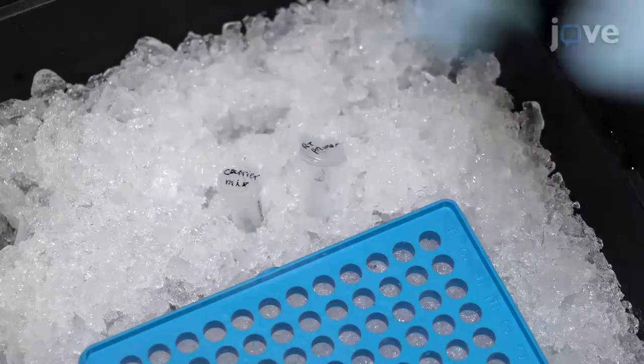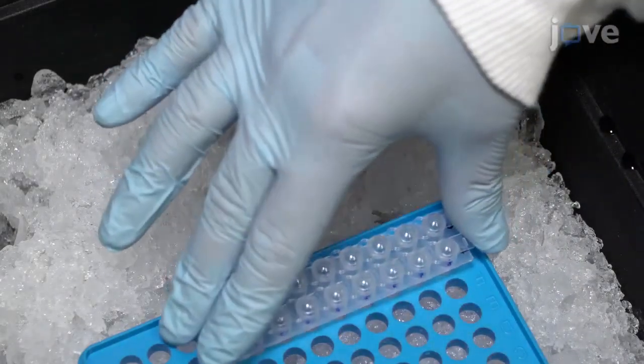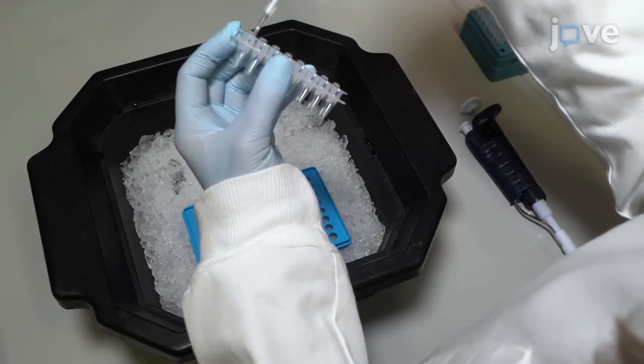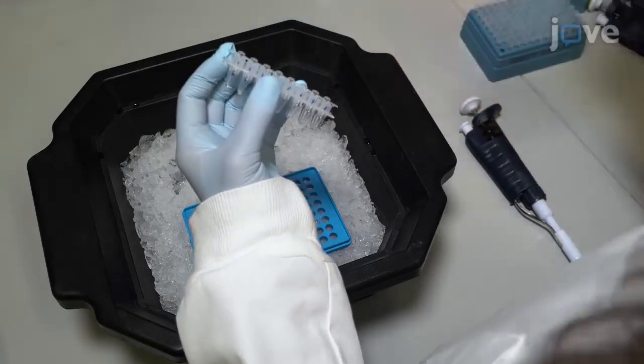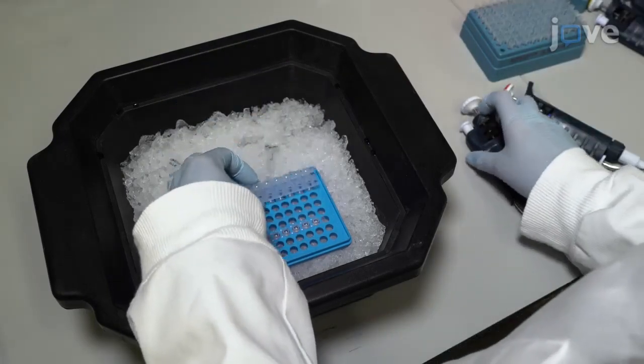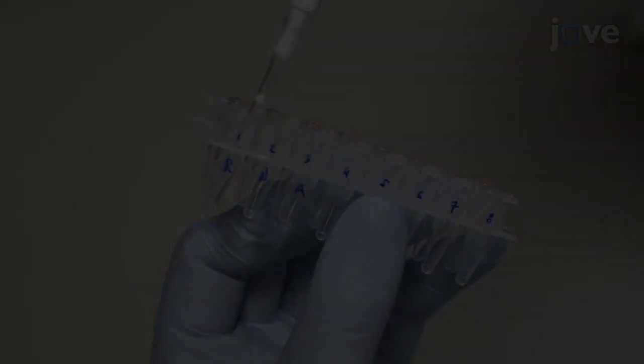Perform reverse transcription, or RT, on the RNA of interest. Combine 1 µL of reverse transcription primer, 10 ng of RNA, and 4,990 ng of carrier mix in a total volume of 10 µL. Mix by pipetting up and down.